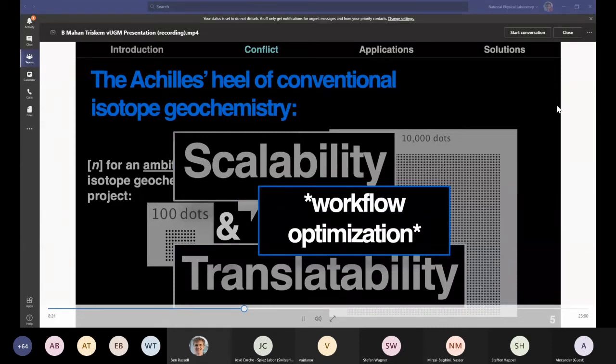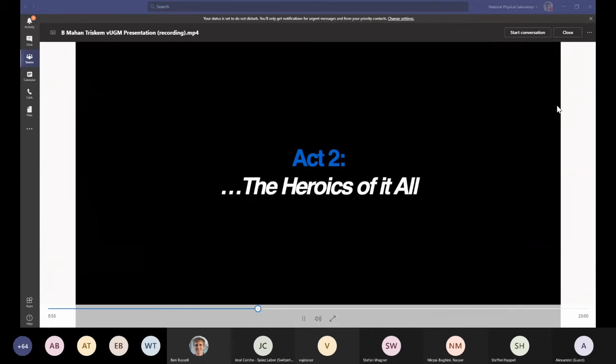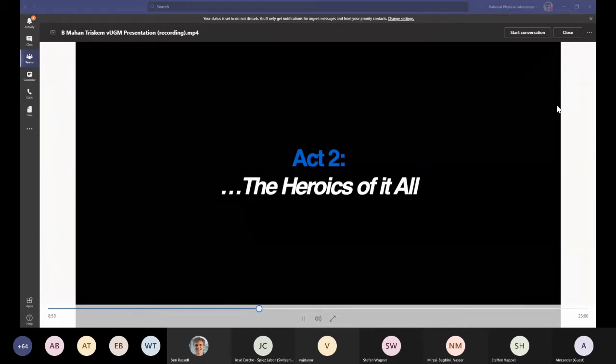So just before we move on, the point here and why this takes so long is, say you had 10 to 12 samples that you're doing through manual ion exchange chromatography, just in your fume hood or whatever, say for something like copper or zinc, end to end, that may take you anywhere from about a week to 10 days or something like that. So you can imagine, even to get to 100 samples, that's going to take you a fair bit of time. And of course, there's some leeway in there, but the point is, it takes a long time, and you would be hard pressed to ever reach 10,000 samples for a single study unless you spent more or less an academic lifetime doing it. So that's really problematic. Okay, so why do we care then?